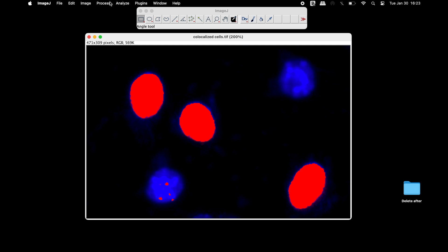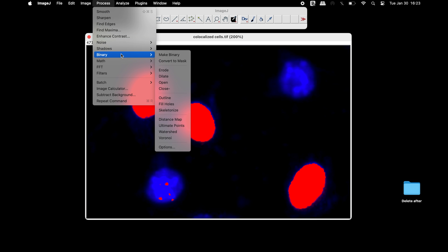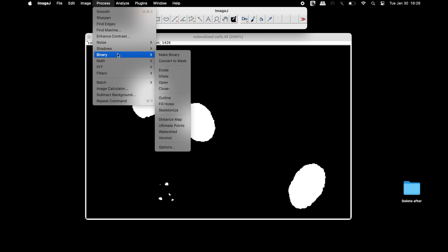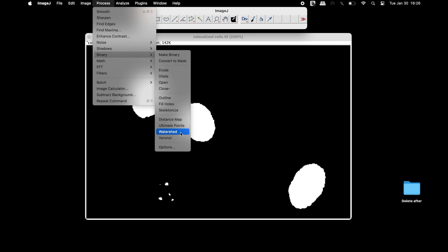The next step is to convert the image into binary. If there are gaps inside the thresholded cells, users can utilize the fill holes feature. Users can also utilize the watershed option to separate cell clumps into individual cells if needed.